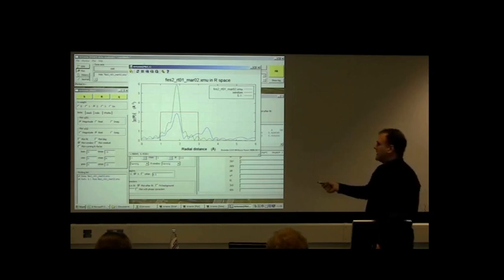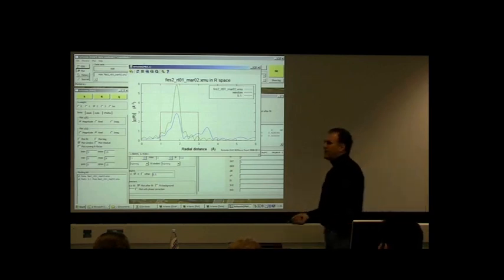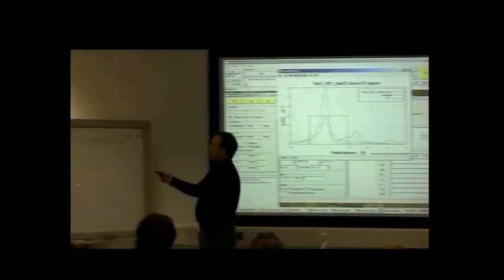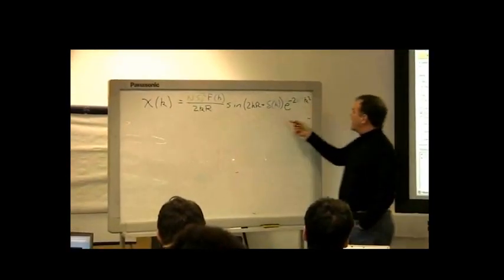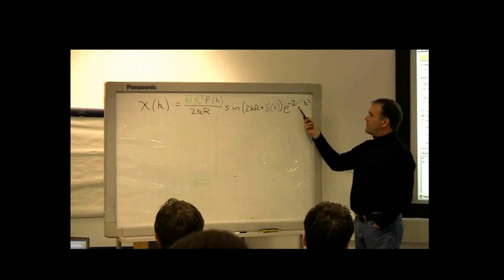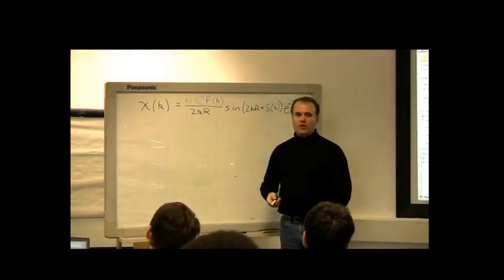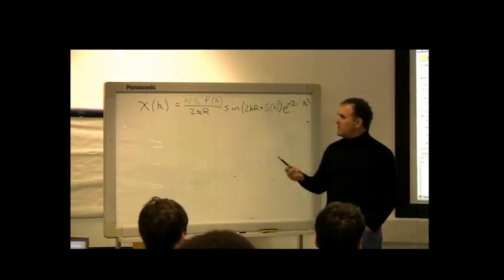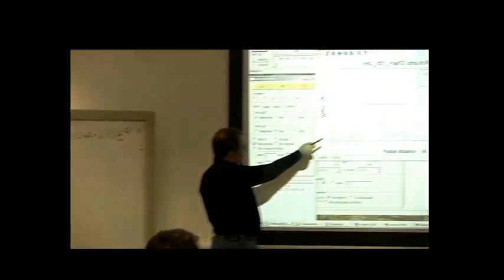Now, the green line, the plot of the path, is much, much bigger than the data, and that's because in the EXAFS equation, which we saw briefly yesterday, I haven't done anything to evaluate S0 squared or sigma squared. Sigma squared is currently 0, and S0 squared is currently 1. When we actually do the fit, part of what we'll do is adjust these numbers so that the green line looks like the first part of the blue line.